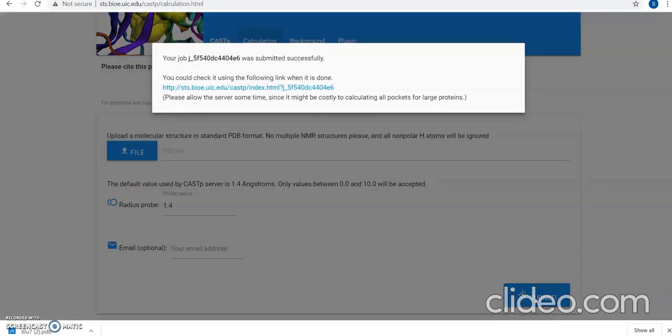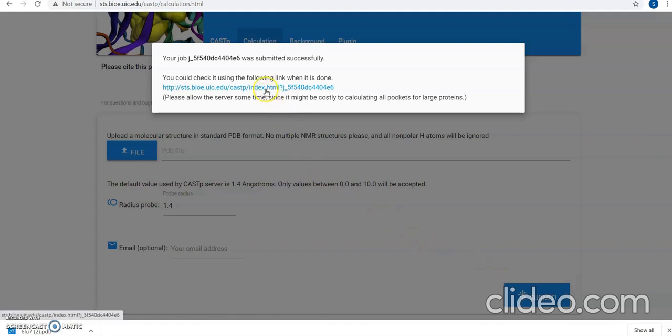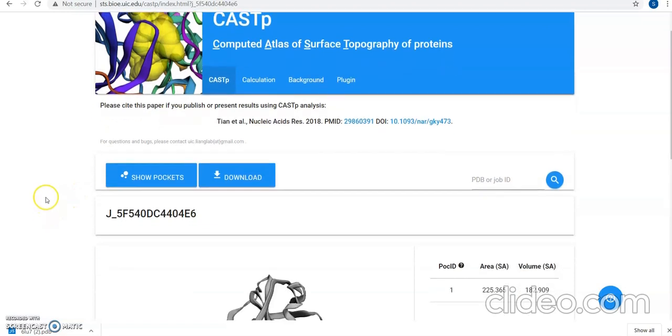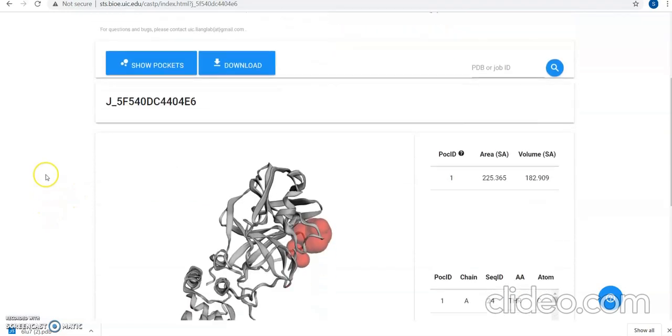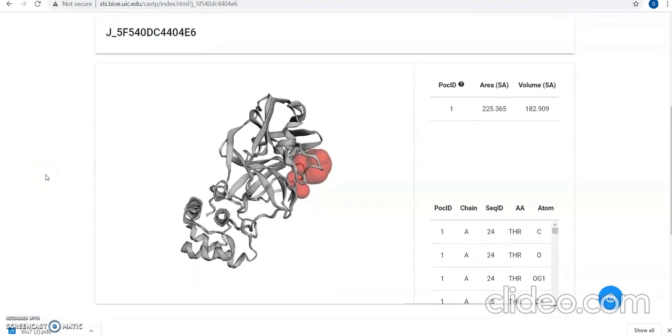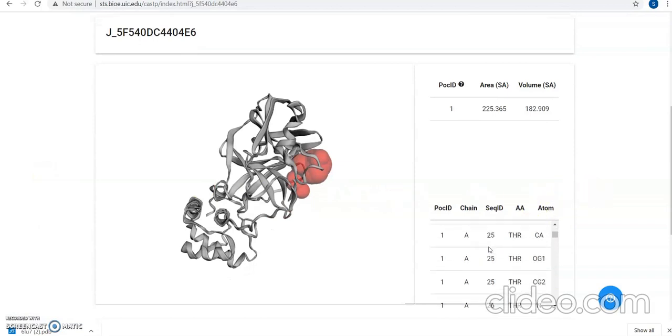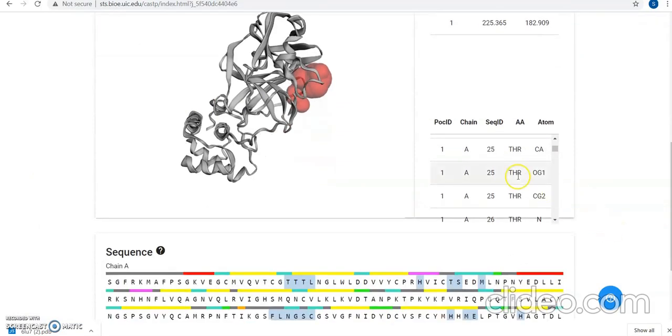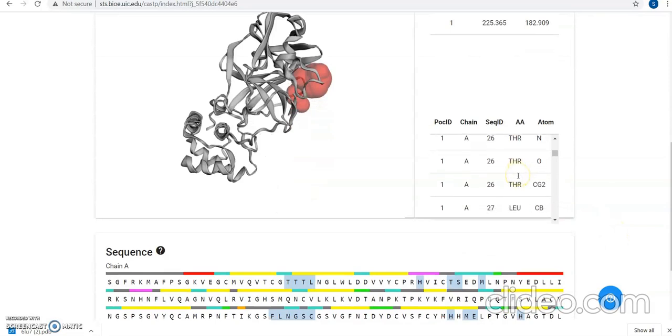You can see there is a link but you should not click on it immediately as it requires time to process. Give it a few seconds and then you can click on it. As you can see, our results are ready. This is the structure that we had uploaded and here you can see if you scroll down, these are the active sites that we will be needing.